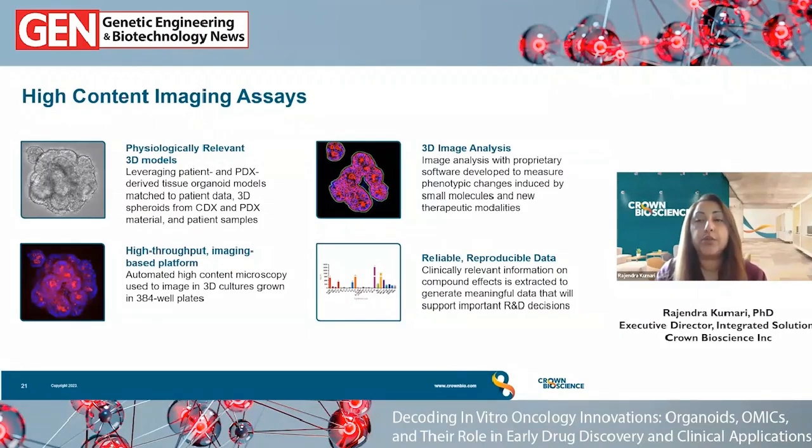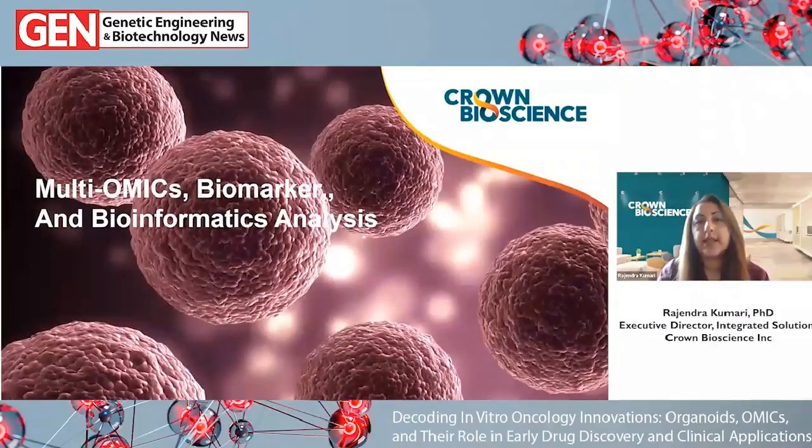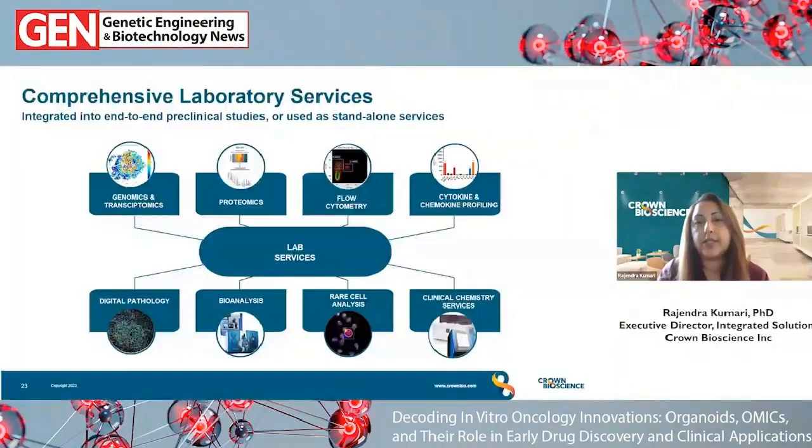It can reconstruct the 3D images to visualize the effects and also provide quantitative phenotypic readouts so that you have additional information as well as the tumor kill. The high content imaging and the data is then analyzed in-house by our team with the proprietary software. And this has been specifically developed to measure those different phenotypic changes. So this leads to the next section of the talk, which is looking at the power of analysis and the critical steps for biomarker discovery.